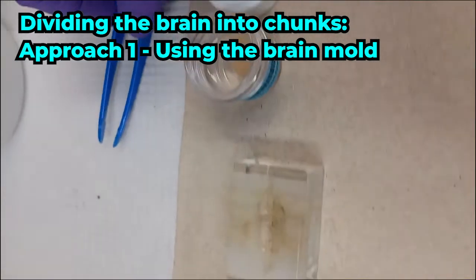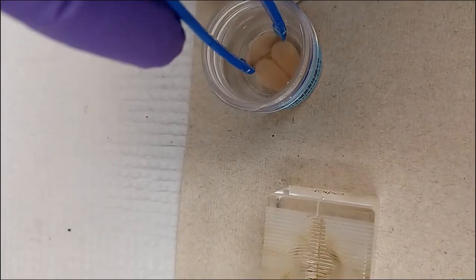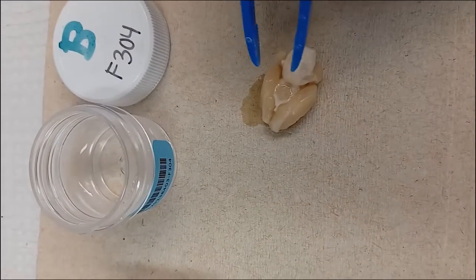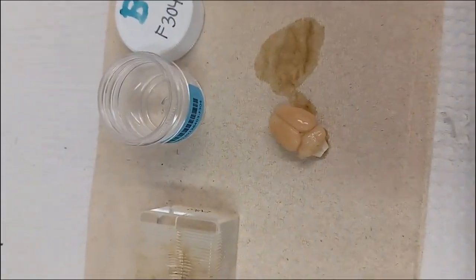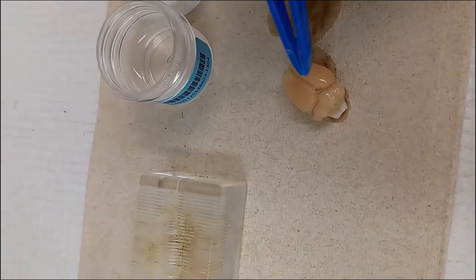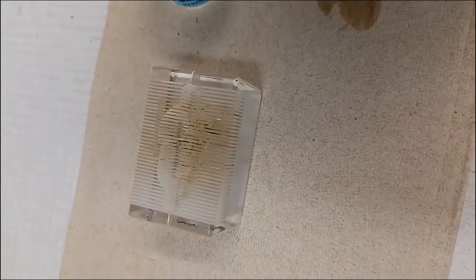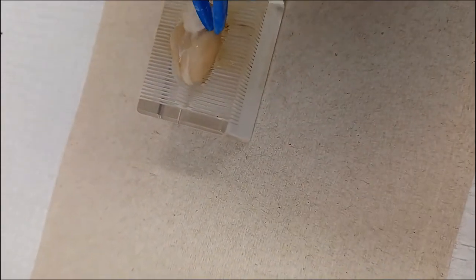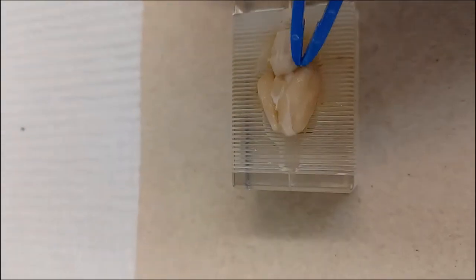We have our brain tissue in a vial in PBS and sodium azide. We'll take it out and briefly dry it off. There are two possible approaches to hemisecting: we can slice it as-is on the paper towel, or we can try to fit it into this brain mold. Since we also have to cut the brain hemisections in half themselves — basically quartering the brain — we're going to go for the brain mold option.